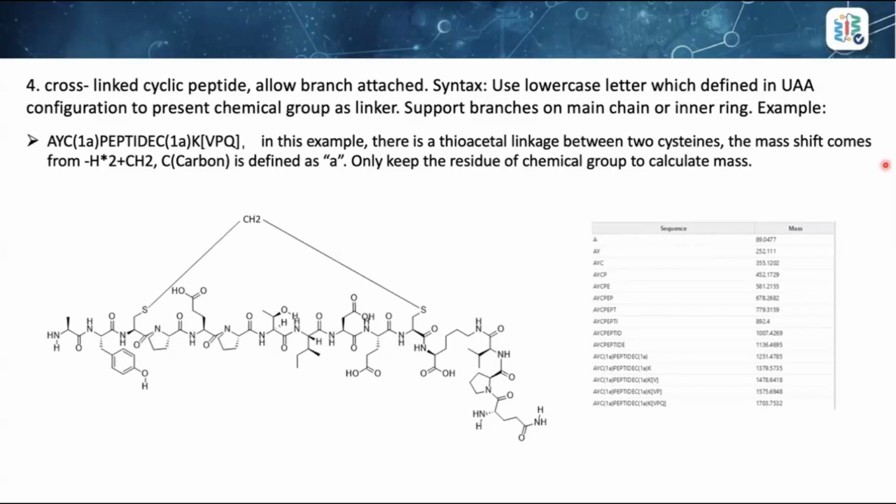Because there are so many molecules with such complex sequences and structures, we also provide a dedicated tool that we named mass validation in our software. This function helps us verify the calculated sequence mass based on the input sequence, and we generate a comprehensive peptide list, including all subsequences produced by unspecific digestion.